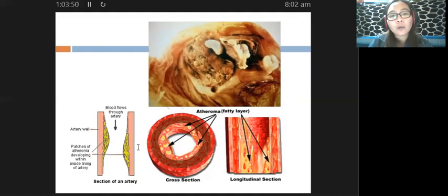Okay. Another would be our atherosclerotic vessels. So as we all know, plaque formation can take place in our arteries, okay, due to the deposition on the arterial wall. So it will harden your arteries, causing now atherosclerosis. All right? So these are the different samples that have to be decalcified. Okay, because of the presence of mineral deposits or calcium deposits.